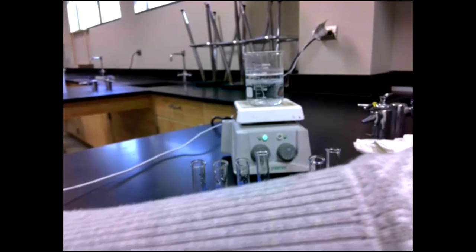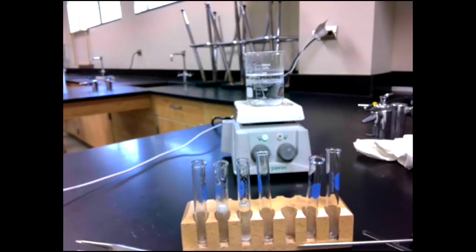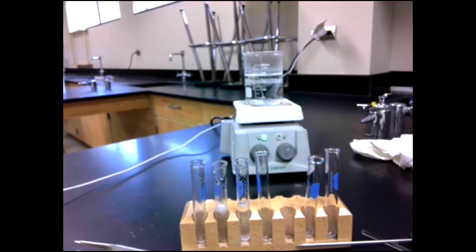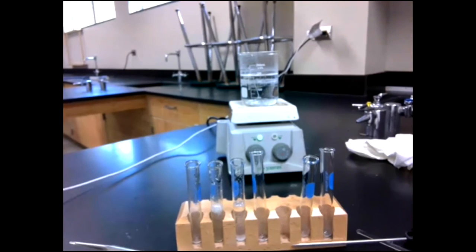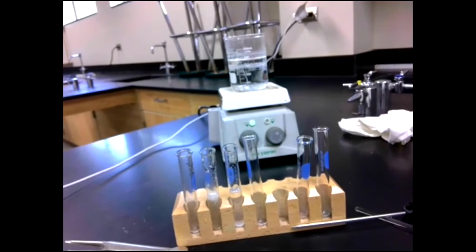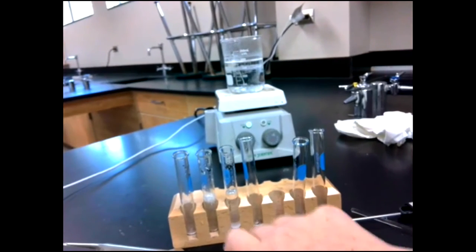The question was about A. So, the number doesn't matter. When we were measuring the conductivity with the meter, it was flashing all over the place. We don't write down the numbers. We just say, yes, it was conducting. It's just a yes or a no. This device isn't going to tell us exactly how much it's conducting. So just say the fact that the numbers were flashing means that yes, it was conducting. Okay, so we're done with that.